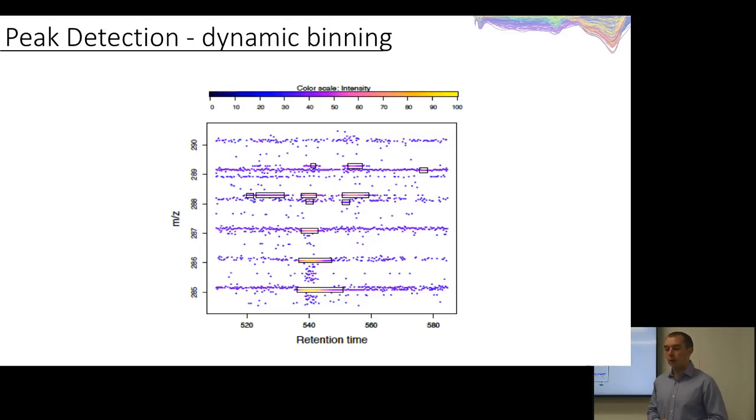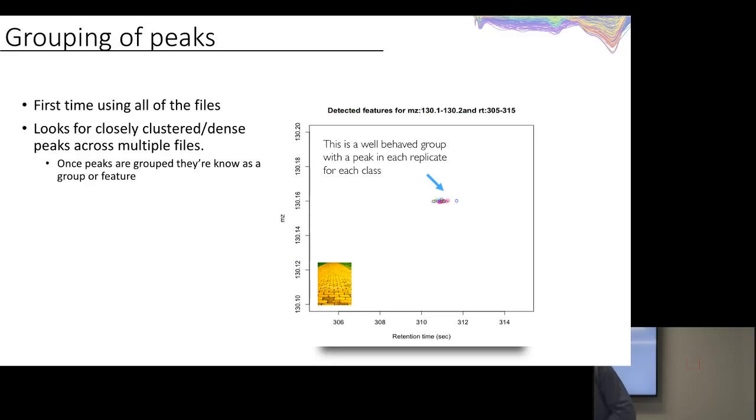Stefan and his group decided to use wavelets for this, which fit very nicely. And I can put a wavelet over the top of these areas and find out their intensity. This is very nice because I've dynamically binned over my data set. I haven't had to go point by point by point by point, like many algorithms still do even today.